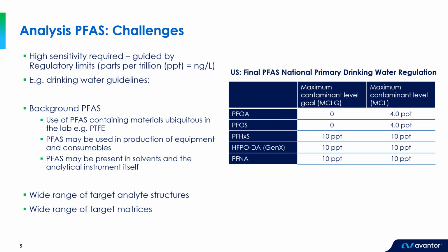So to employ LC-MS for PFAS analysis, we need to consider a number of key challenges. Firstly, the high sensitivity that we require, which, as we discussed last time, is largely driven by regulatory limits, which require analysis in the parts per trillion or nanogram per liter range.